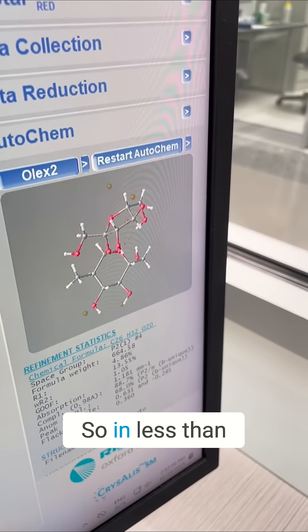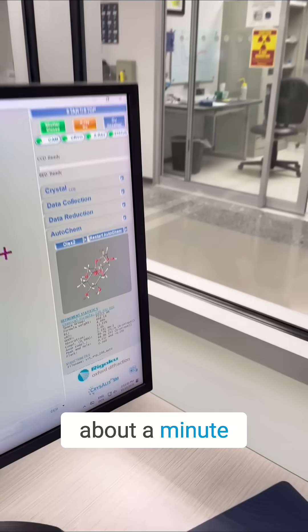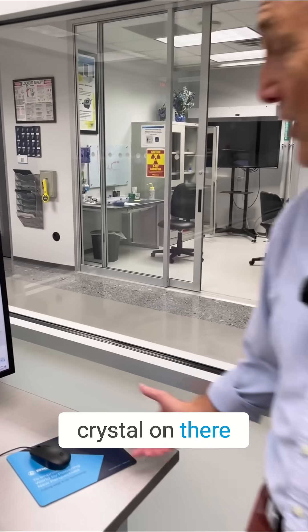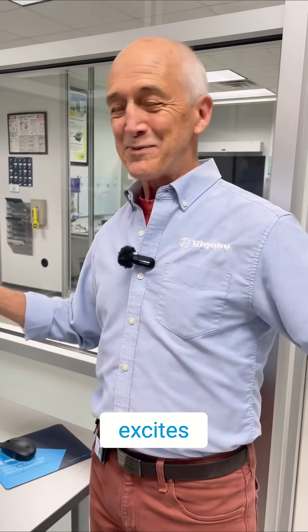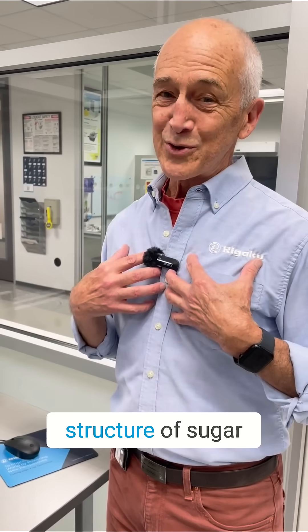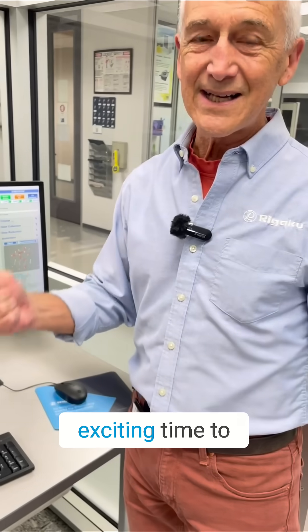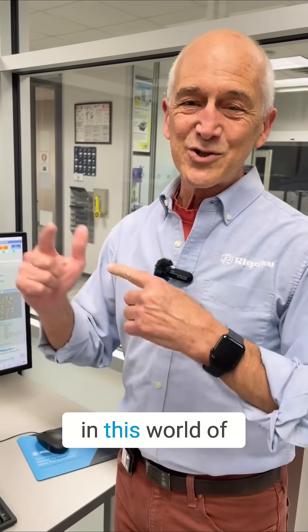So in less than about a minute after putting the crystal on there, we figured out the structure of sugar. And that just excites me to know, not that I don't know the structure of sugar, it's just an exciting time to be in this world of crystallography.